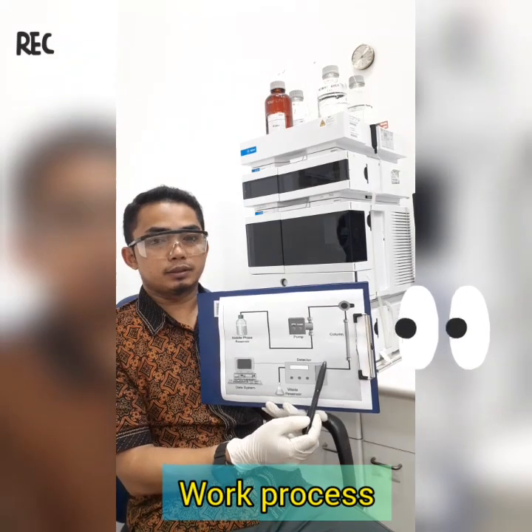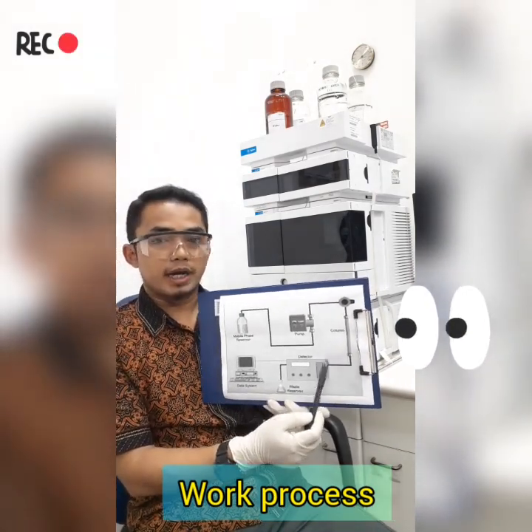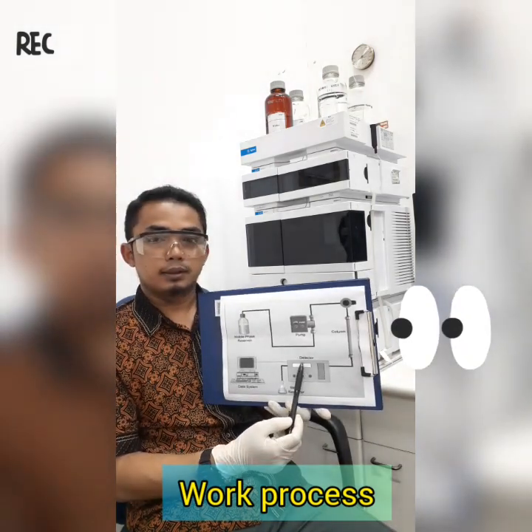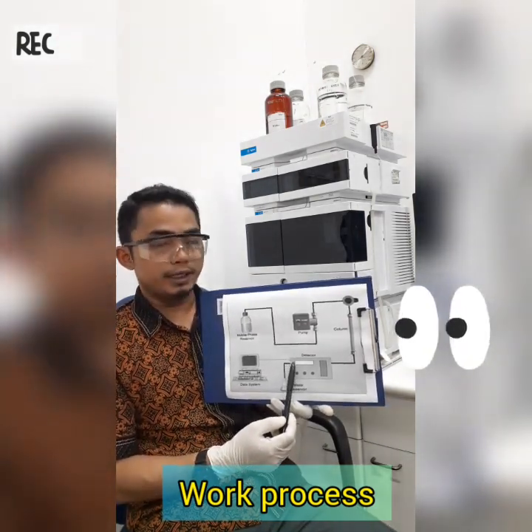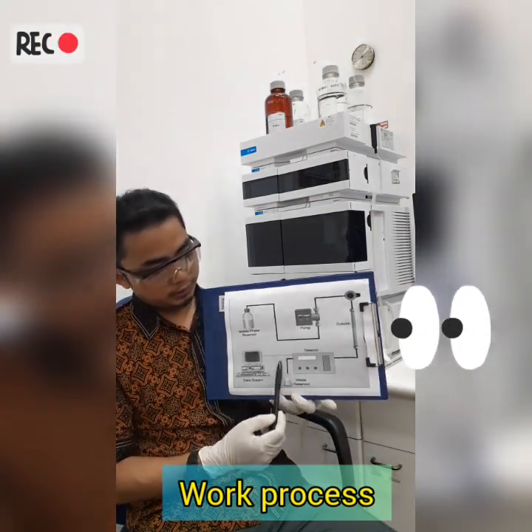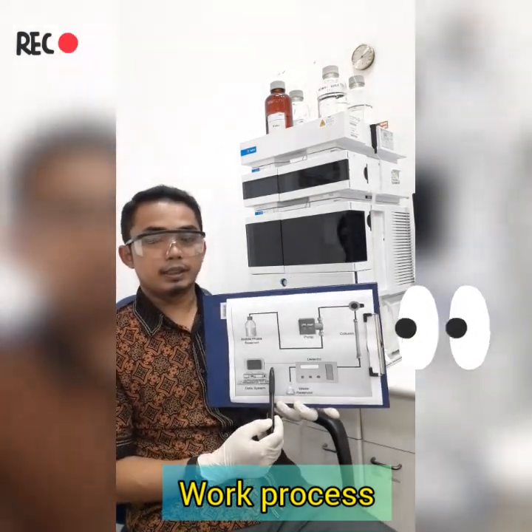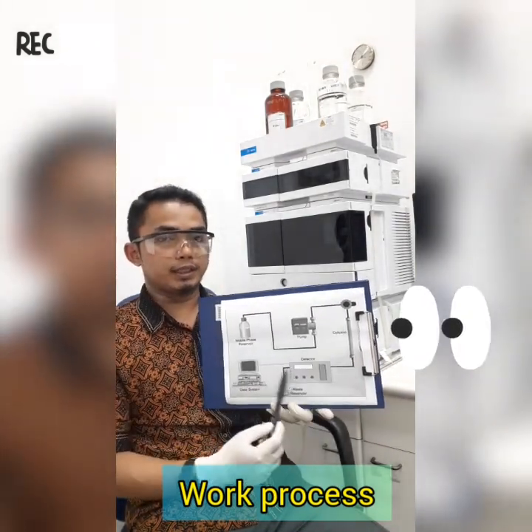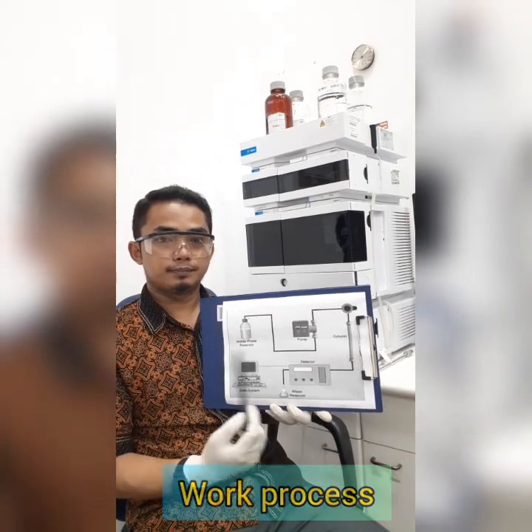The separation result will be detected by the detector unit, and the separation result data can be displayed with the data processing system. This is the simple flow of how HPLC works.